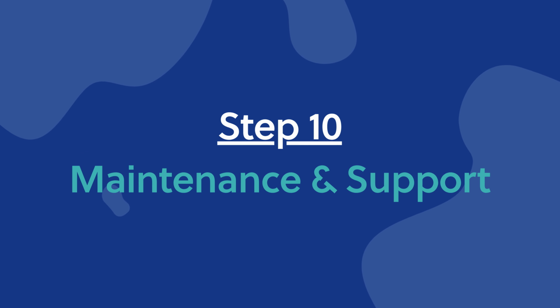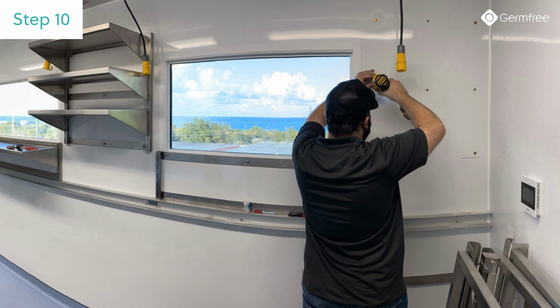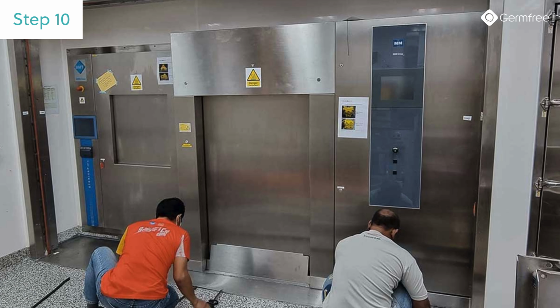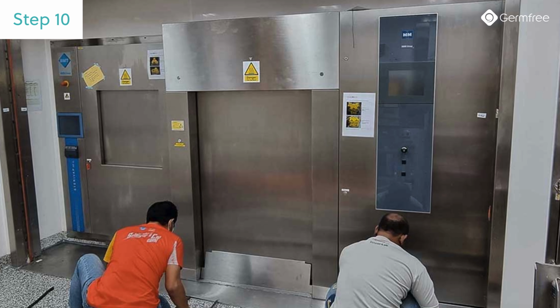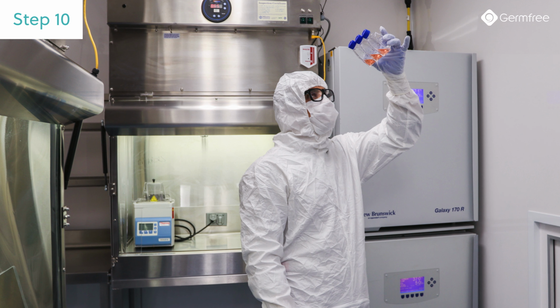Even after installation, Germfree is with you every step of the way. Our 24/7 service team travels worldwide to maintain your facilities and equipment, providing preventative maintenance and full service support to ensure long-term reliability. From Asia to the USA, we keep your operations running at the highest standards anywhere in the world.